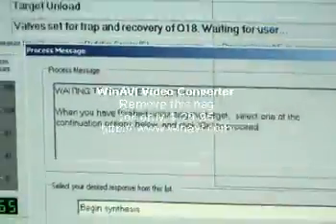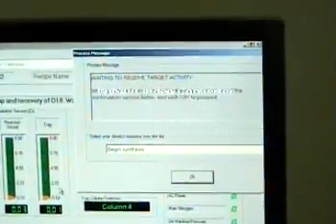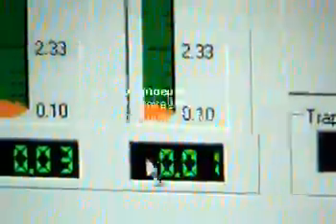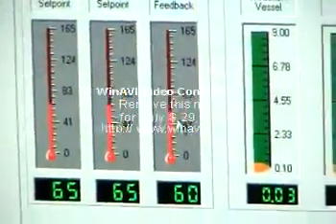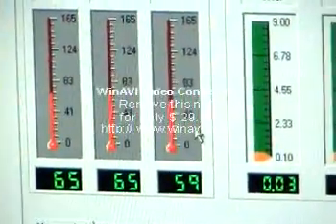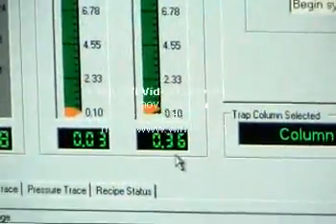A window opens like this. It gives us time for the F-18 to get collected in the QMA. Here you can see the QMA reading — the amount of F-18 trapped in the QMA is displayed here. This is the reaction vessel activity; whatever activity is present in the reaction vessel is displayed here. These are the temperature readings: top set point, bottom set point, and IR feedback showing temperatures maintained in the reactor. You can see the reading is going up as activity is being collected in the QMA. Almost 1 curie is collected so far.